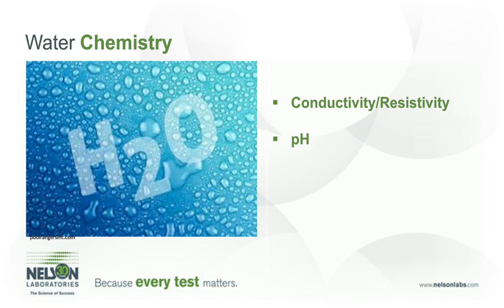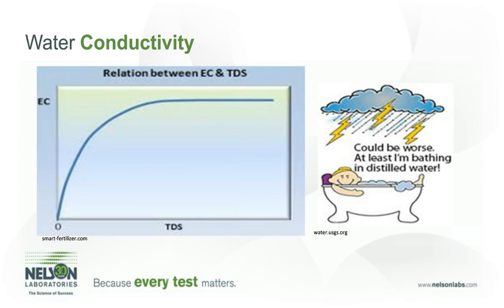Electrical conductivity in water is directly related to the ionic content, and therefore it's affected by the presence of inorganic dissolved salts such as chloride, nitrate, sulfate, and phosphate anions, which carry a negative charge. It is also affected by sodium, magnesium, calcium, iron, and aluminum cations, which carry a positive charge. Technically speaking, water conductivity is a measure of the ion-facilitated electron flow through water. More clearly stated, it is the ability of water to conduct an electrical current based on its ionic concentration.